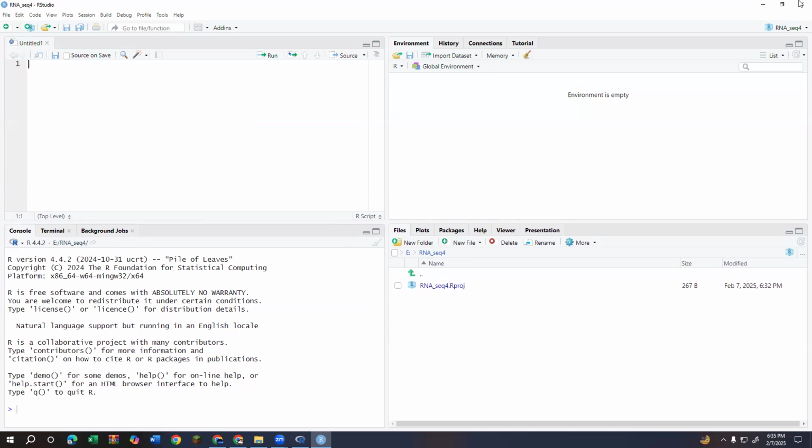Okay, now our next task is about packages. What is package?